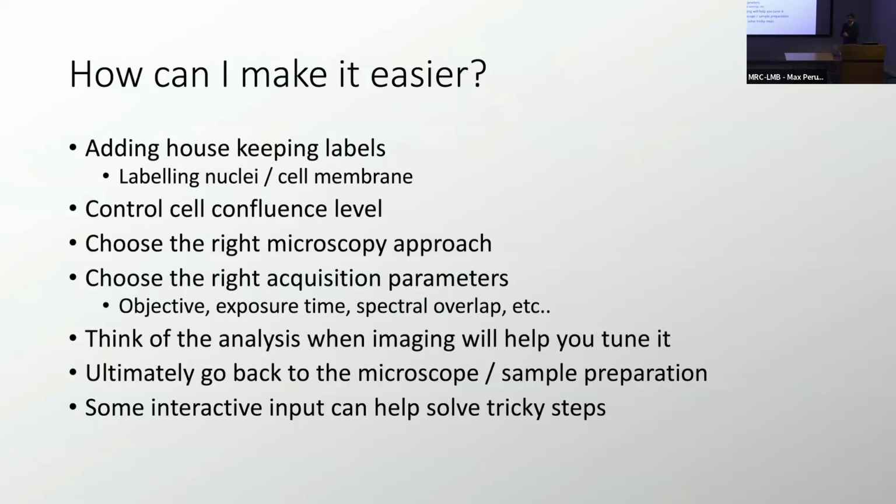There are some parts which are easier to do manually, a bit time consuming, but it will smooth our workflow. It can be cropping the right part of the image or making a selection in the image which says, okay, I want to analyze just this part, and this will help you have a simple workflow because you have focused the whole analysis on this part of the image.